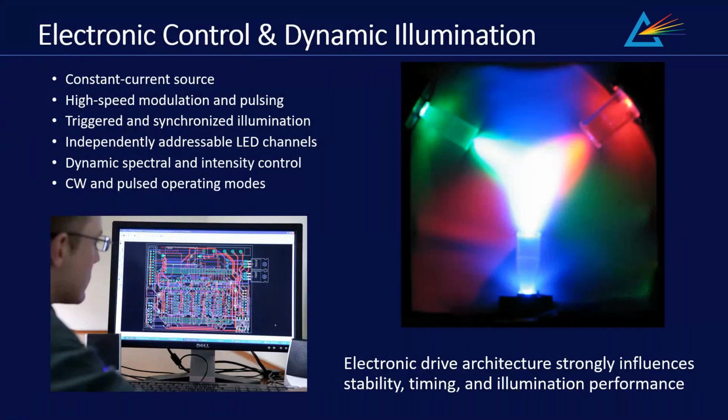Medical applications require precision, accuracy, and repeatability, and properly engineered LED illumination systems can provide these capabilities. Electronic drive architecture plays a central role in the lifetime, stability, timing, and modulation behavior of LED illumination systems. Unlike traditional lamp-based systems, individual LED channels can be electronically adjusted with precise control of current, timing, pulsing, and triggering.